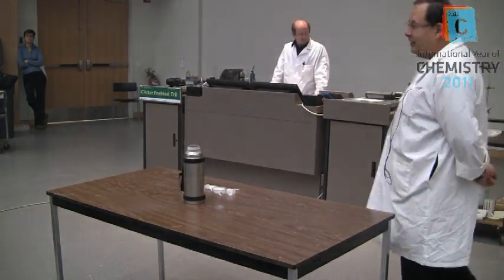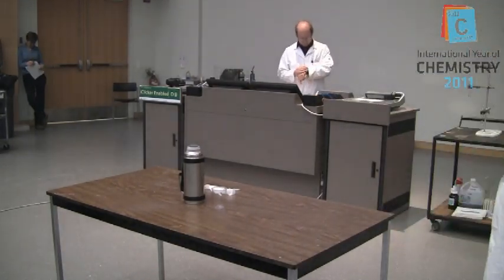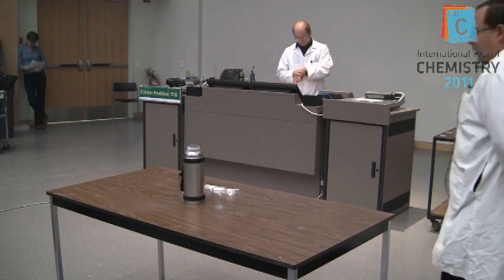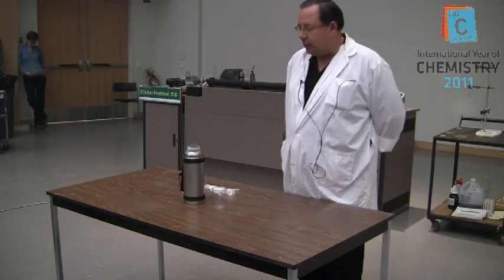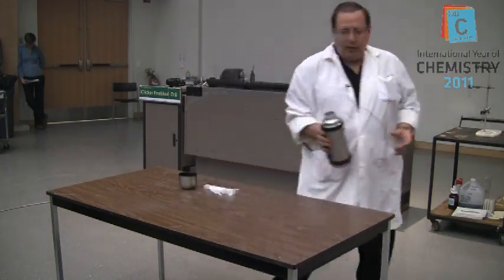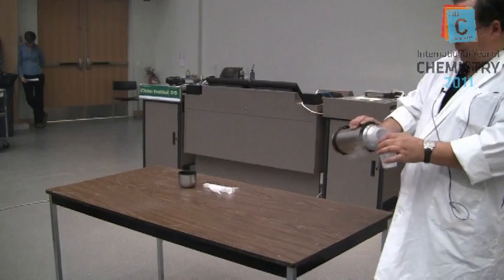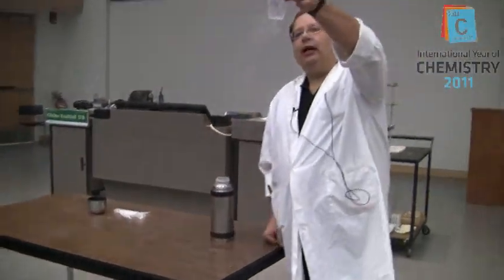Minus 196 degrees Celsius. So I think the lowest temperature on Earth is probably about minus 82. To get this sort of temperature, you're looking at being on the International Space Station, going out for a spacewalk. And yeah, minus 196. Well, let's just have a quick look at it. So here it is here.